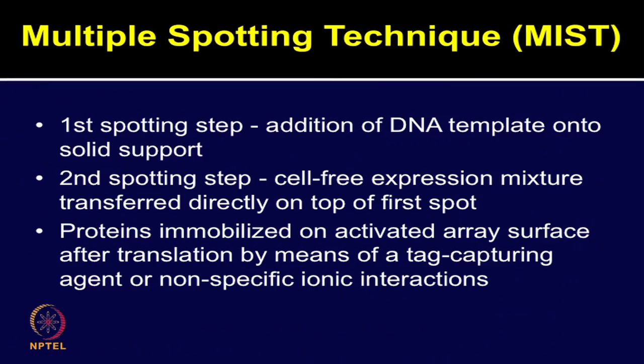Today, we will talk about the multiple spotting technique. This is another approach which facilitates generation of high density protein microarrays by using a cell-free expression system. In the MIST approach, both DNA and the cell-free expression system are printed on the chip surface. Two rounds of spotting are performed.